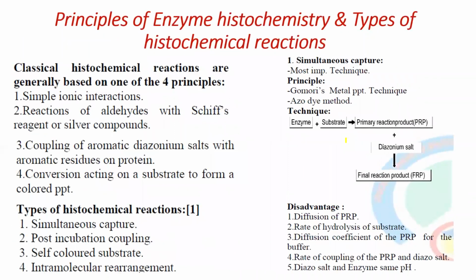Now, when we see the difference between simultaneous capture and post incubation, in simultaneous capture, the bond is not so strong. Okay, so that is why it quickly reacted with the salt. Whereas in post incubation, the bond is very strong, so we need to incubate this insoluble substrate or product for a longer period of time. When I say longer, just half an hour. So we need to incubate this for half an hour in the diazonium salt to get the color.